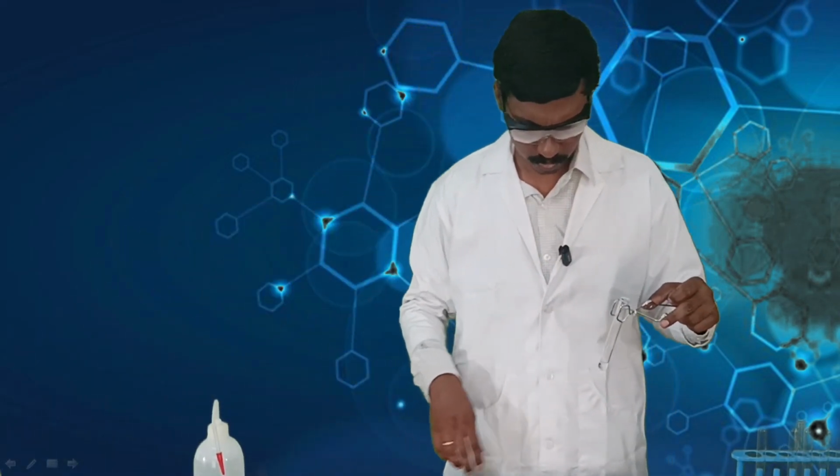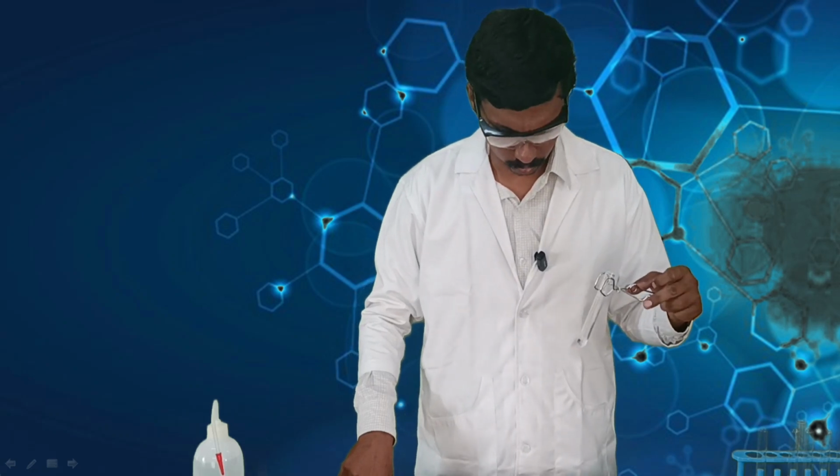The next one is to check whether the given compound is soluble in water or not. If the compound is soluble in water, it tells you that it's a diamide or a carbohydrate.